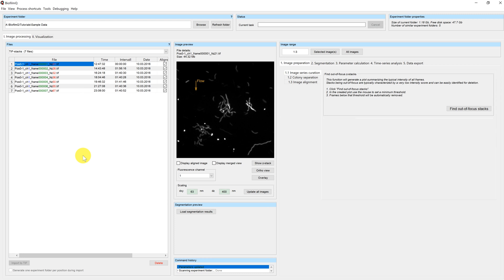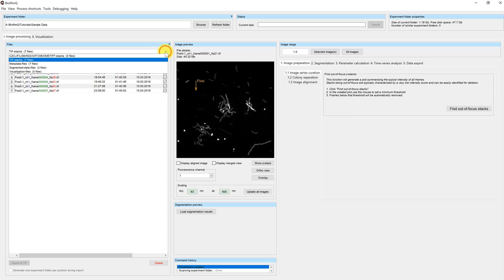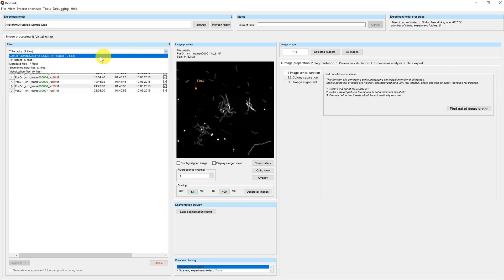There are a number of different file types that BiofilmQ can use, for example TIFF files that you can see here. This is the directory loaded in the last tutorials, but there are also other file types that can be used, such as those generated by your image acquisition software on the microscope like CZI files, ND2 files or OME-TIFF stacks.